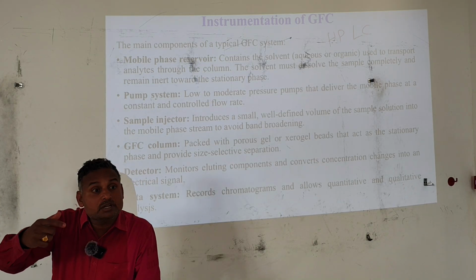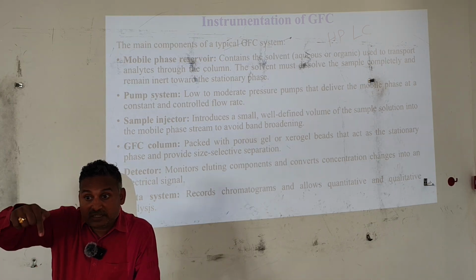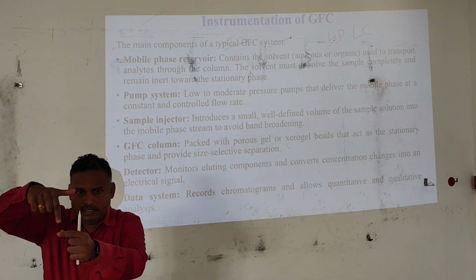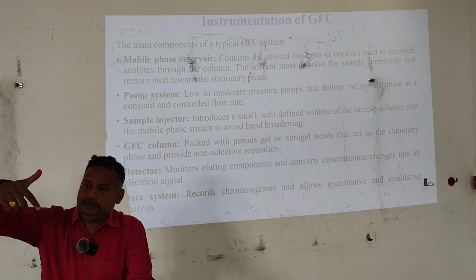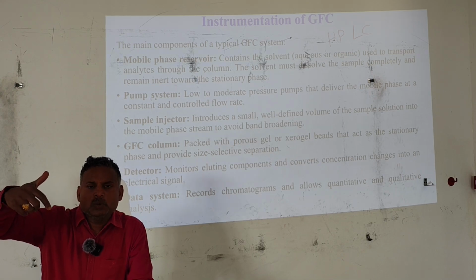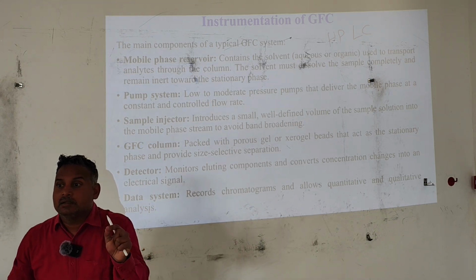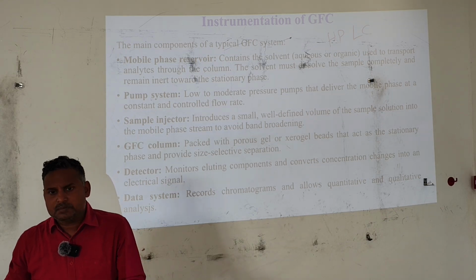Take the sample into the micro syringe, and there is a silicone rubber septum. The specialty of the silicone rubber septum is auto sealing. After injecting and removing the needle, it is immediately closed. Insert the needle inside the silicone rubber septum and inject very quickly, so that all the sample enters the sample injection system at the same time.